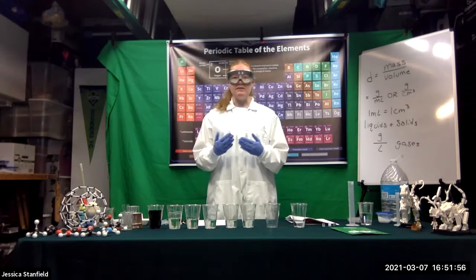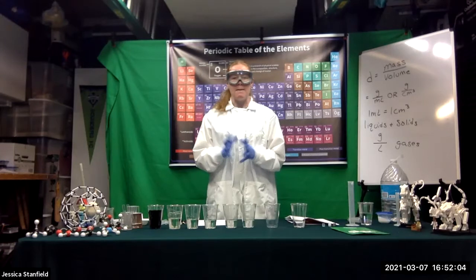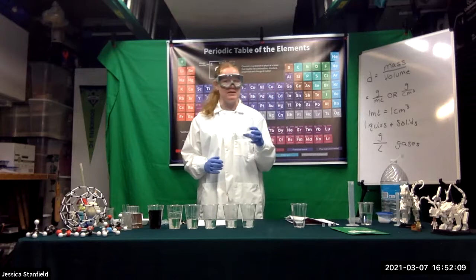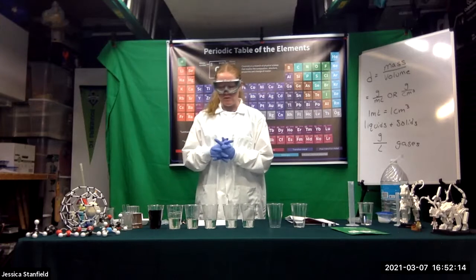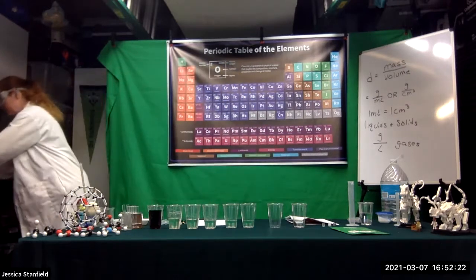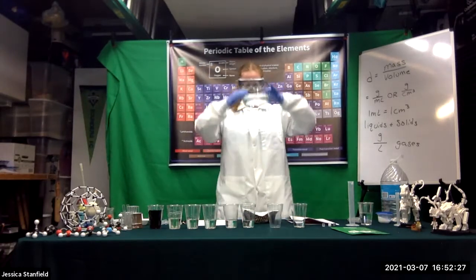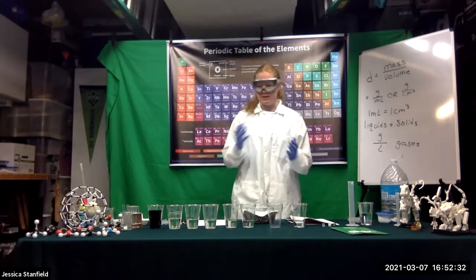So if you do decide to use the method that your lab manual suggests with heating stuff up in the microwave in short bursts, make sure you do so in another container because these plastic cups, I wouldn't recommend sticking those in the microwave. If you do set everything up and realize that your 40, 50, 60% solutions are taking a really long time to dissolve, all hope is not lost. There is another option. Okay, what you can do is you can create a water bath. You can take a shallow dish like I have right here, and you can heat some water. I wouldn't heat it to boiling, but you can heat water up.